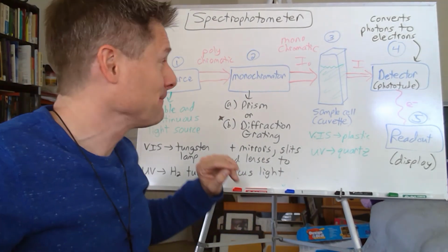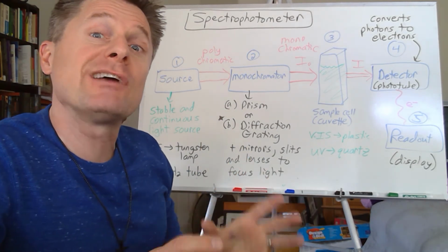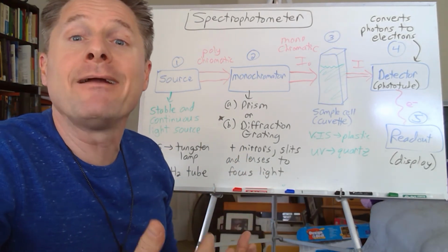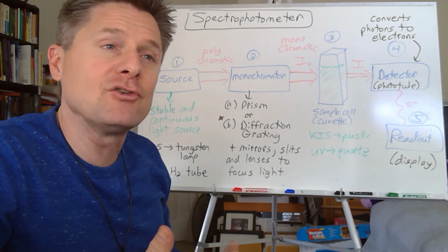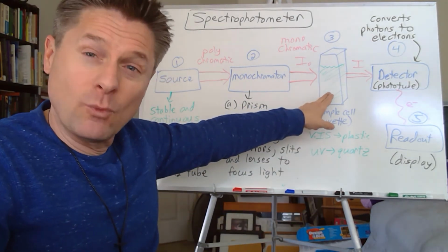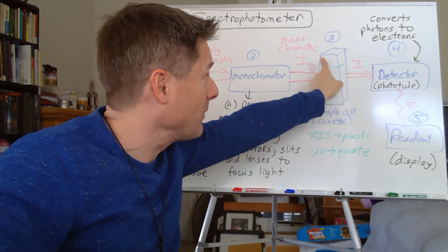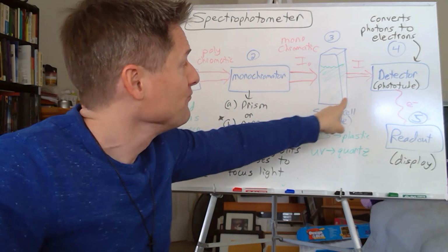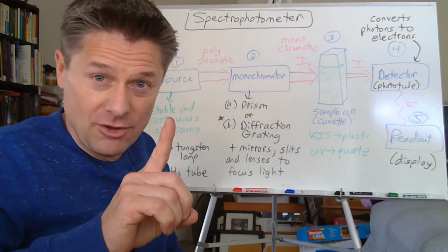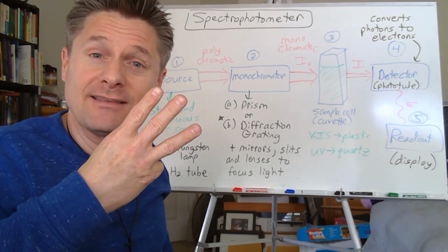They're pricey. One thing you've got to watch out for is we want the absorption of just the solute. We're going to be doing an iron sample. We're going to be looking at iron(II) ions, I think, complexed in solution. Well, you still have to worry about the solvent and the cuvette. Remember, the absorbance we measure, right? It drops down to this final intensity. That's the absorption of the solute, the solvent, and the cuvette. There's three things causing that, right?